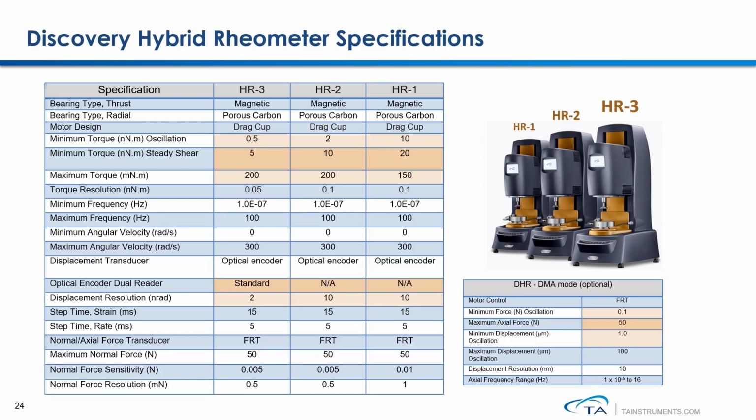When using a specific rheometer, you should always keep an eye on the instrument's specifications. Specifically, you will need to keep an eye on the instrument's torque range, the resolution for angular displacement, and what is the maximum velocity the instrument can rotate. This will help you with your experimental designs.